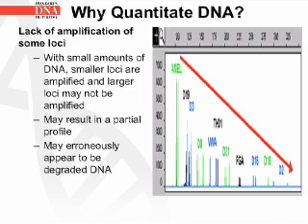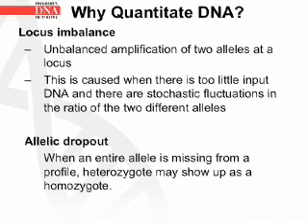Lack of amplification of some loci occurs with small amounts of DNA. Smaller loci are amplified and larger loci may not be amplified, which can result in a partial profile or the profile may erroneously appear to be from degraded DNA. The diagram shows that the peak heights of the smaller loci which come off first are much higher than the peak heights of the larger loci which come off later. Locus imbalance occurs when there is unbalanced amplification of two alleles at a locus, caused by too little input DNA and stochastic fluctuations in the ratio of the two different alleles.